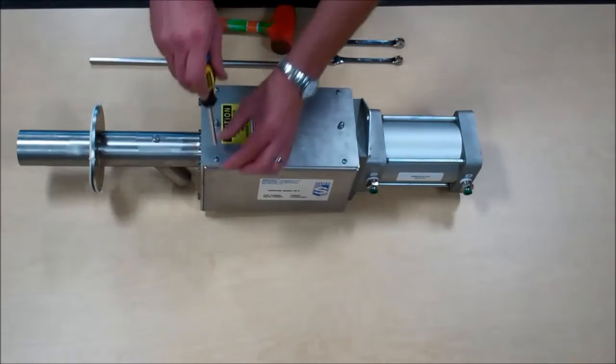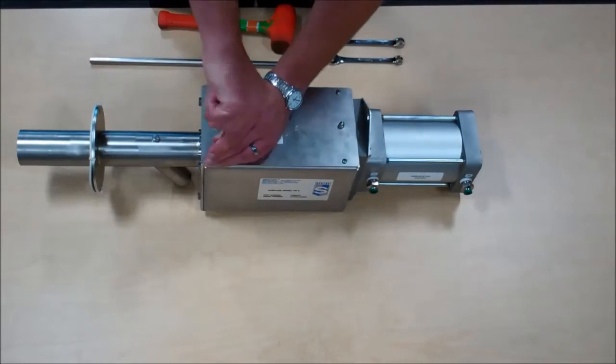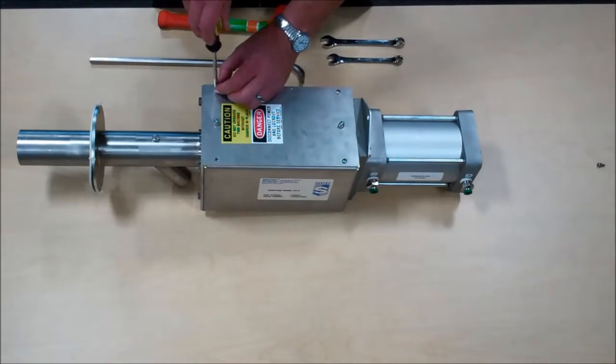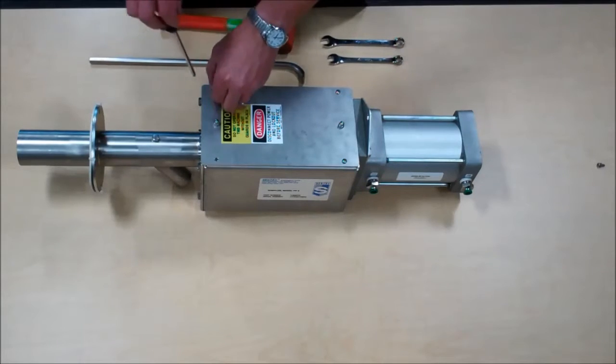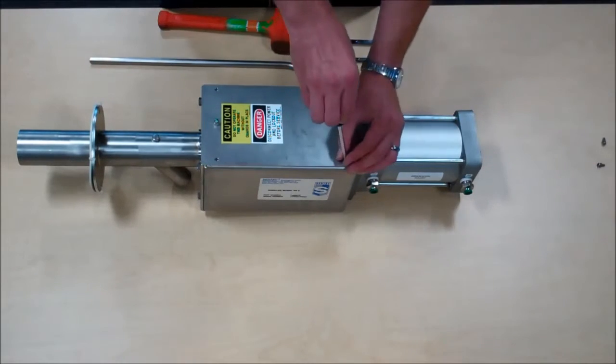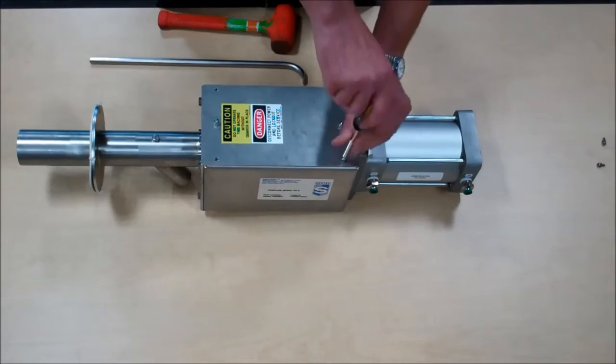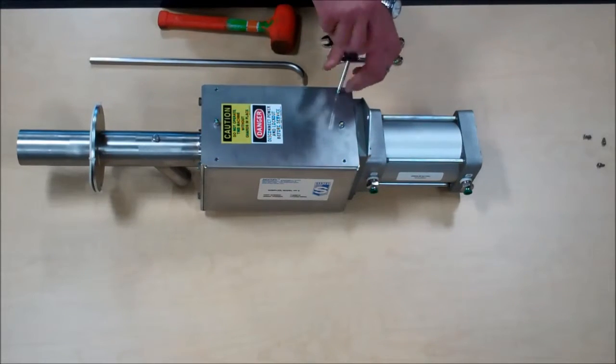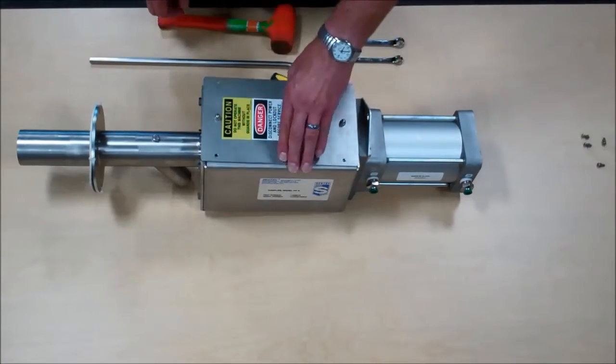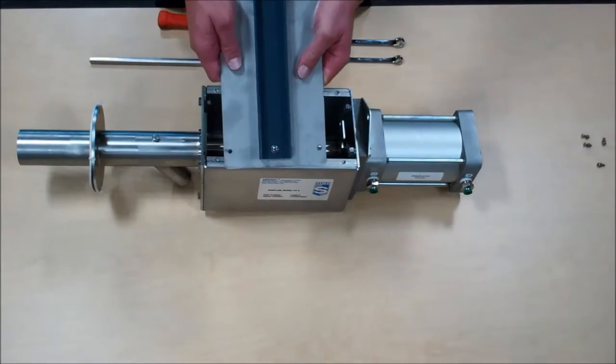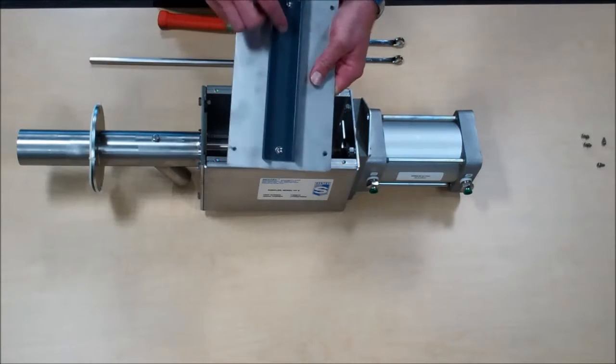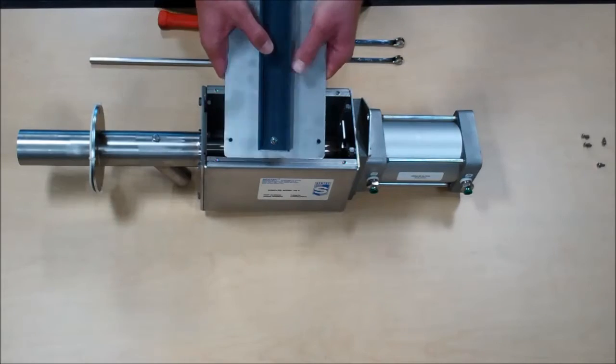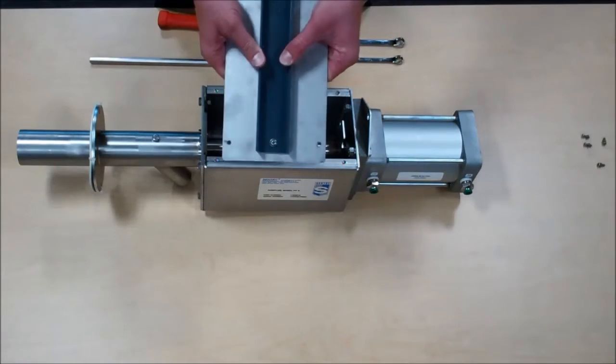We'll begin by removing the cover plates. Note the condition of this channel mounted to the inside of the top cover plate. This is the guide for the sample tube and needs to be in good, complete condition.